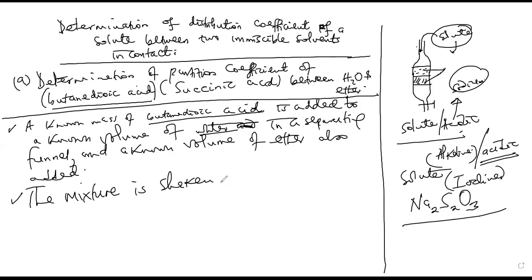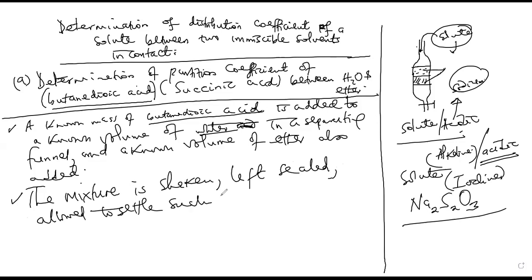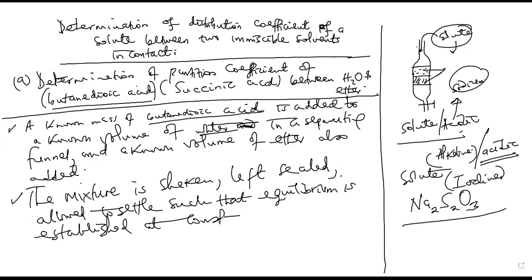So the mixture is shaken and left sealed, allowed to stand or allowed to settle such that equilibrium is established at constant temperature.